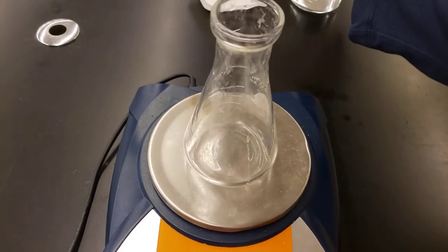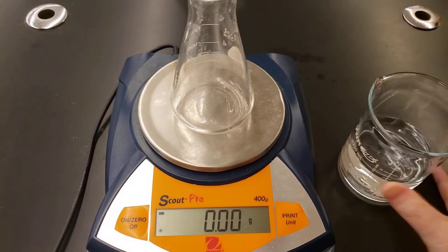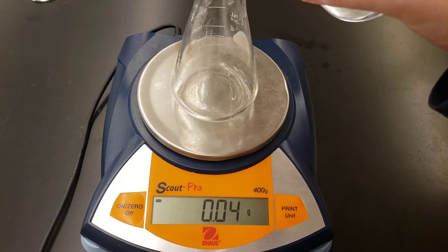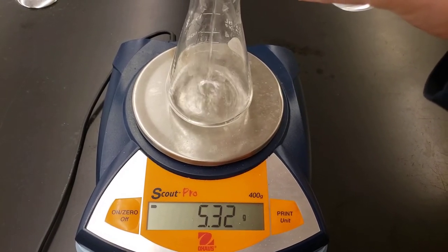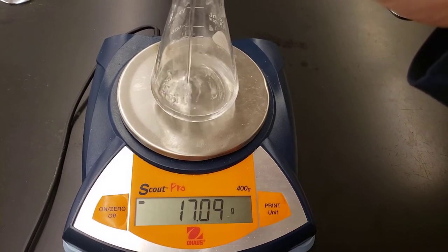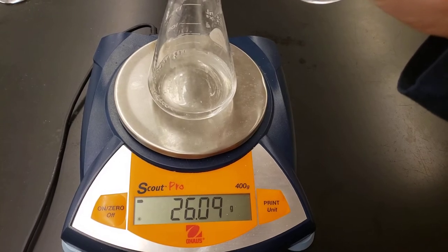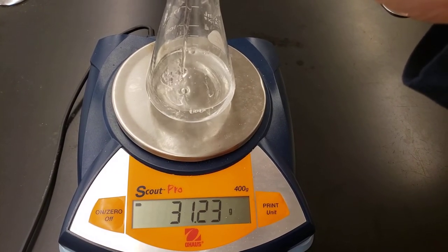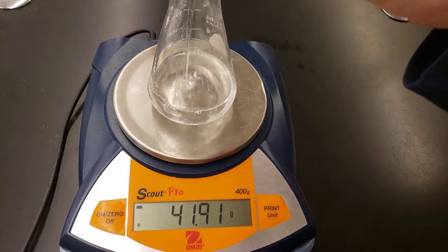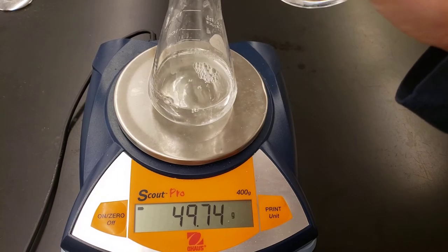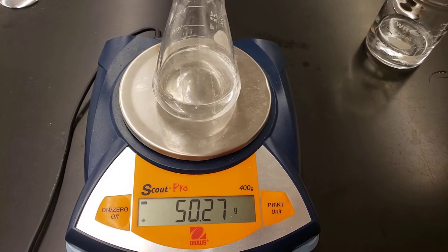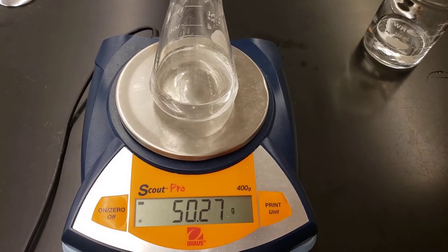Next I want to get as close to 50 grams of vinegar as I can. So I have my beaker full of vinegar and I'm going to pour it in, stopping occasionally, and I'm trying to get 50 grams of vinegar in there. Now I might not be able to get exactly 50 grams so we're just going to get as close as we can and that looks it. So write down that mass 50.27 grams as your mass of your vinegar.